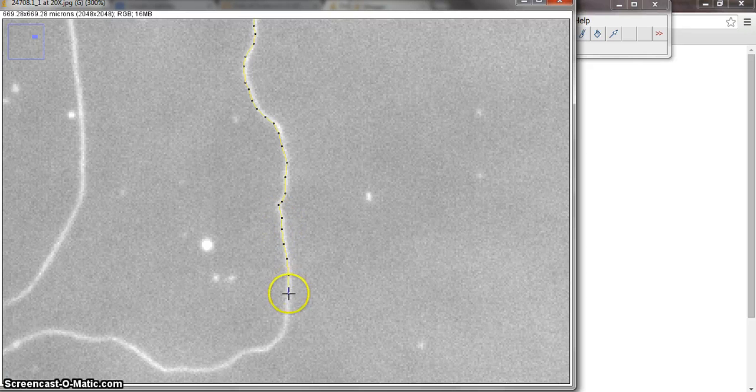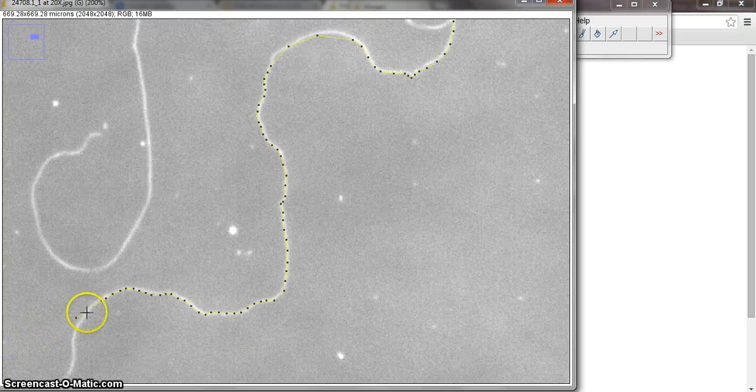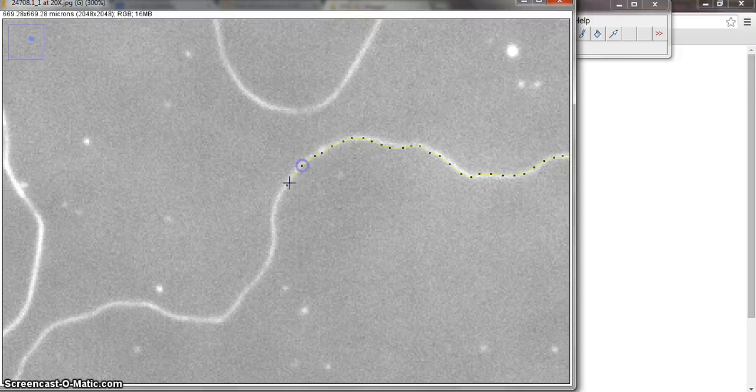All right, so this takes a certain amount of time. The other thing is, when you're done measuring, you double click. Sometimes you double click by accident. If you're going quickly and you didn't move the mouse far enough, the program might interpret that as a double click, in which case your segment is done. Don't fret. You can take that measurement and then keep going from that point and add it together.